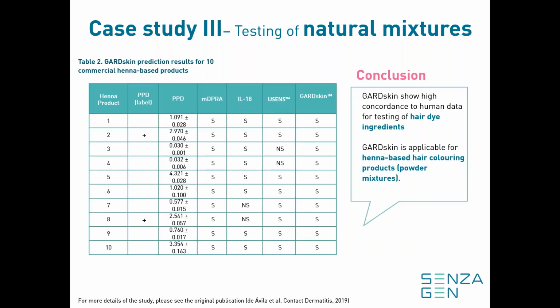So we also went on to test the 10 commercially available finished henna-based products, and all of these substances were classified as skin sensitizers in the GARD skin assay, which is in very good concordance with the predictions also from the other in vitro assays.